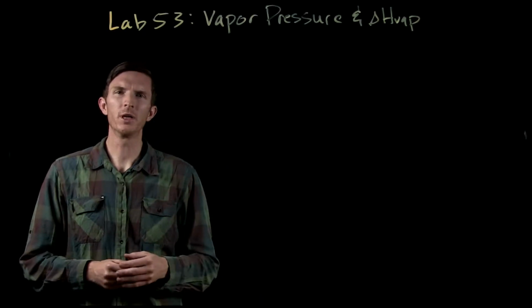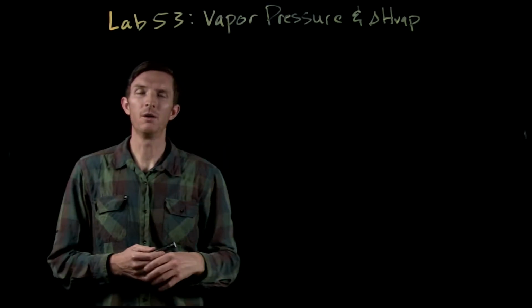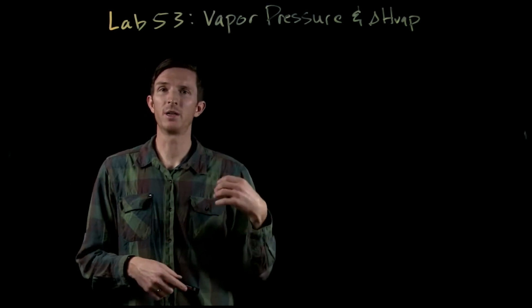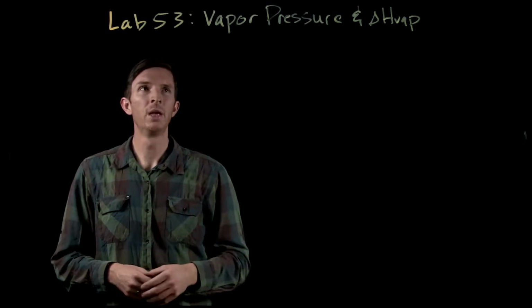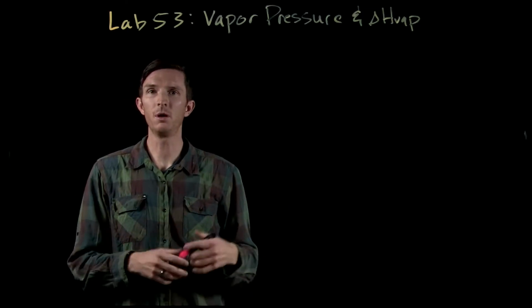In the lab this week, what we're going to do is determine the enthalpy of vaporization for a specific compound, in this case ethanol and methanol. And we're going to do that by looking at the vapor pressure of those two compounds.